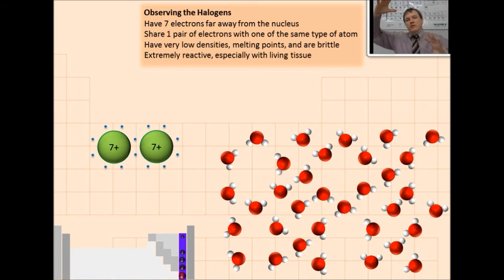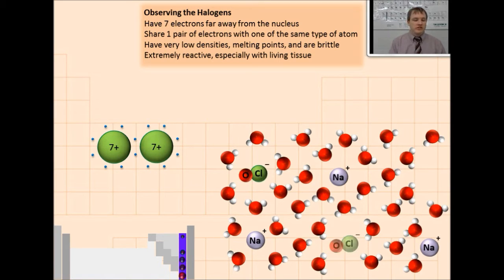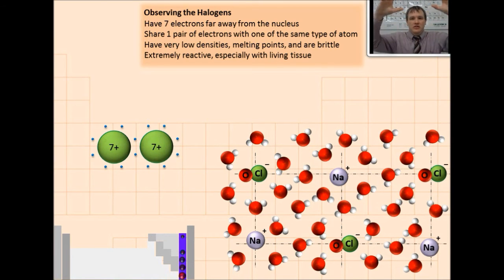We've got these water molecules that are sort of doing their thing, and then all of a sudden we put another substance into the water molecules, and the water molecules will surround that substance. So here I have sodium hypochlorite, which is made up of atoms of sodium, atoms of oxygen, and atoms of chlorine. Sodium hypochlorite dissolves in water, which means water molecules get between the atoms and cause them to spread out from one another. You'll see that I've shown these as ions, sodium with a plus charge, and the combination of oxygen and chlorine, which we call hypochlorite, has a minus charge.